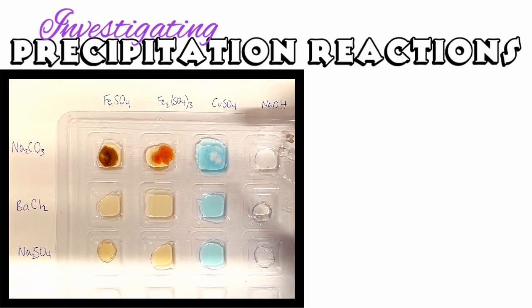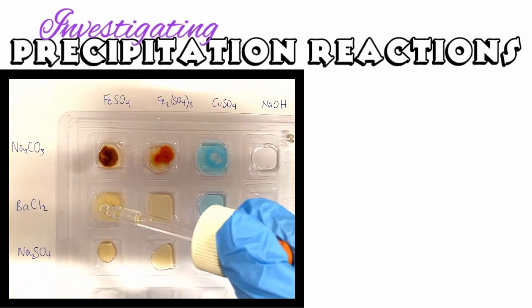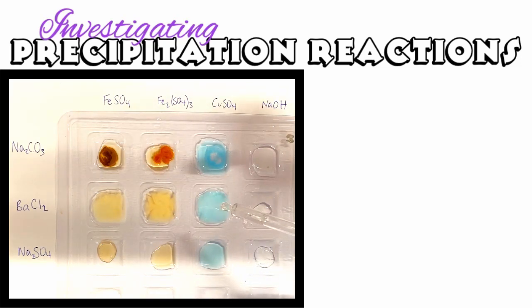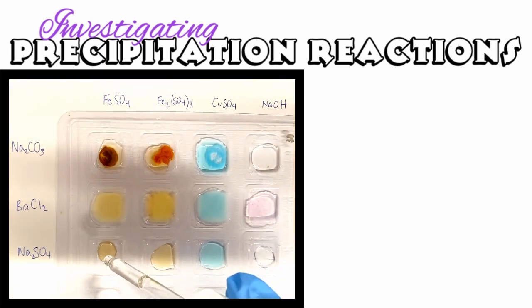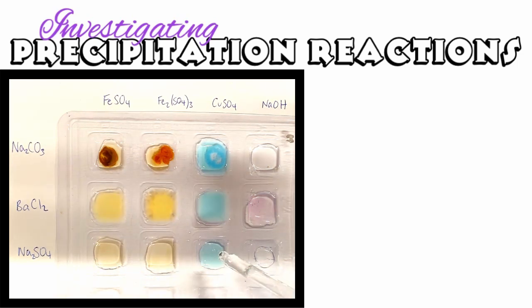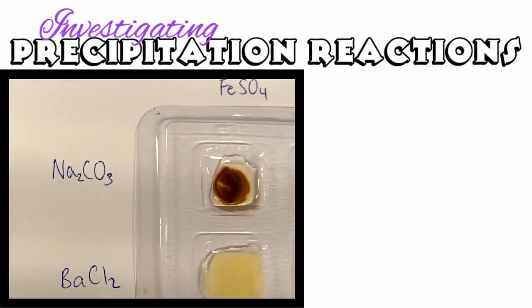Okay, so let's see what happens when sodium carbonate is added to each of these. And now I'm adding the barium chloride. Now I'm adding sodium sulfate. Okay, so I'm just going to zoom in so you can see this a little bit better.